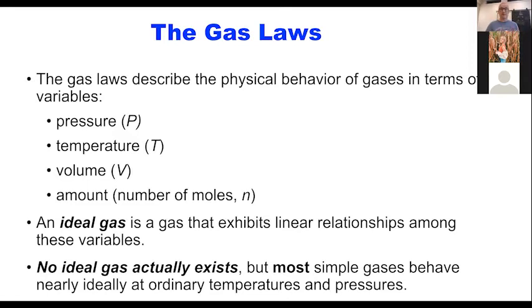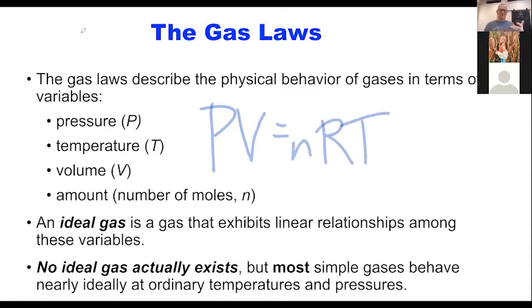So again, we're going to be dealing with the gas laws. Hopefully everyone's quite familiar with our good friend Mr. PVNRT at this point. Let me annotate here. We measure gases with four different measurements. We measure its pressure, we measure its volume, we measure how many moles of gas we have, and we measure the temperature. And then remember, we have a constant that relates all of those things together.